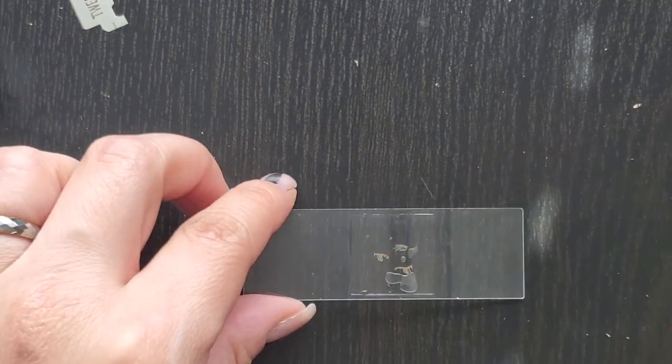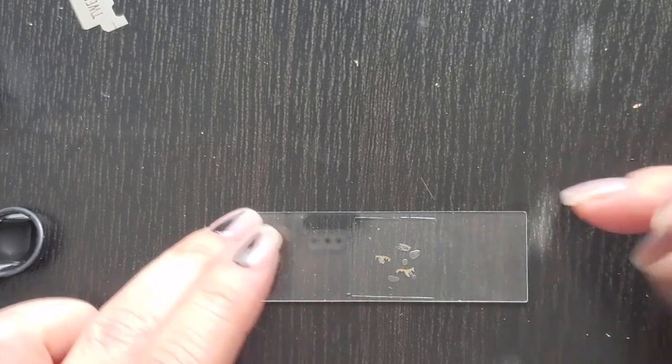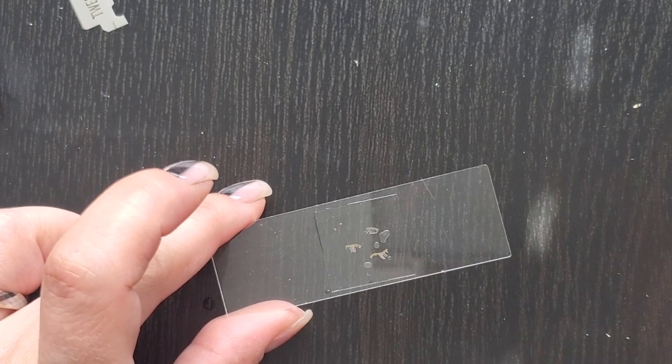So I can't get rid of these air bubbles. You can sort of try to do that. Try to break them up a little bit, but this should be fine. So then let's see what we got under the microscope.